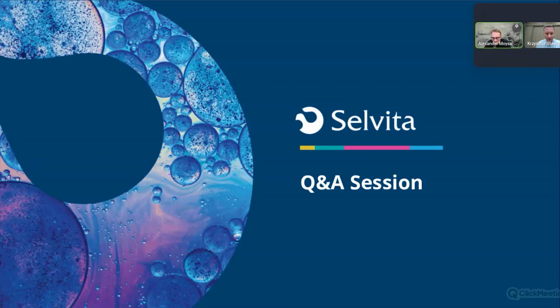And a question from Javier. How reproducible are results from biological replicates with a high fractionation process? Yeah, this is a very difficult question. It's difficult to answer, but this is a very important question. I think it also highly depends on the type of biological experiment, what type of sample we have.